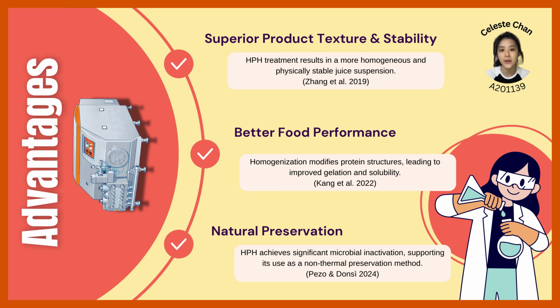Finally, for natural preservation, it inactivates microbes using intense physical force, reducing reliance on heat or chemical additives. Studies support this, showing that HPH achieves significant microbial inactivation, validating its role as a non-thermal preservation method for cleaner label foods.